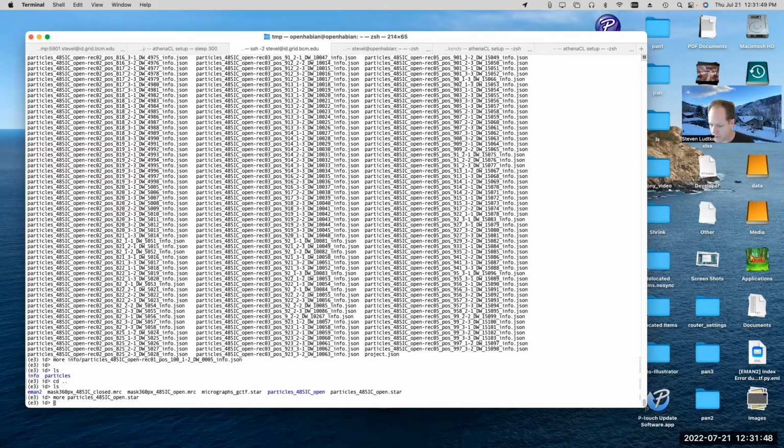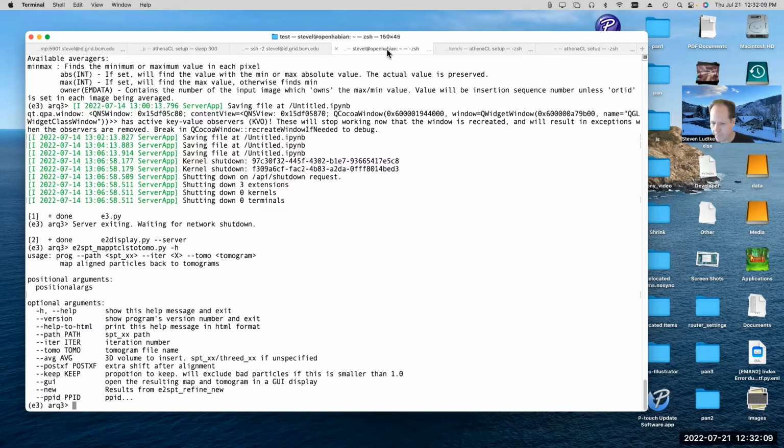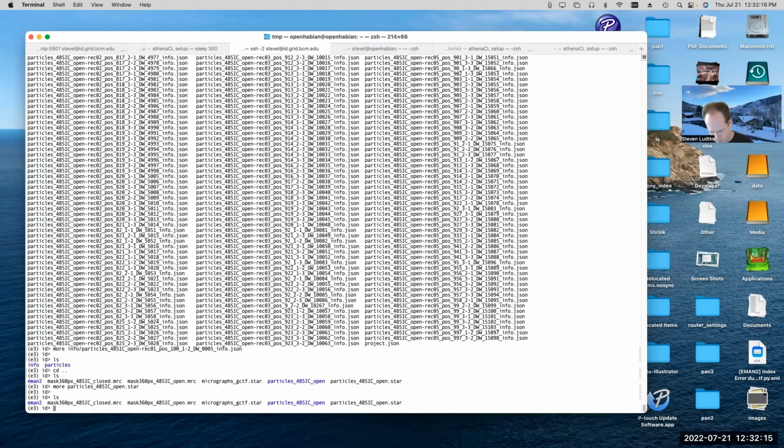But there's no convenient way of easily seeking around the file. So with this pre-release of EMAN2, we've now moved to a newer, old file format, which has been repurposed again, which is the LST file format. It dates back to EMAN1, and it's kind of like the star file, but more flexible.